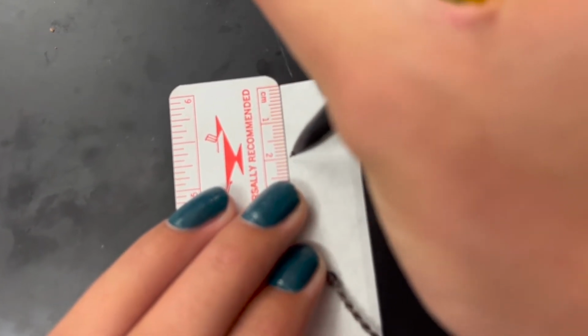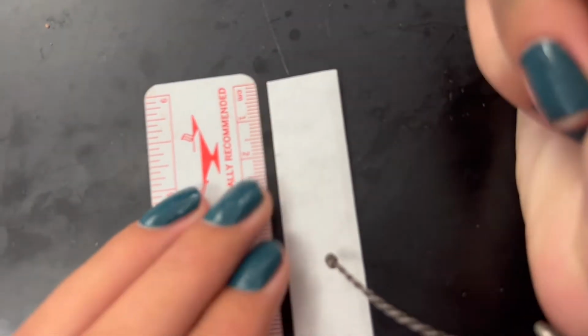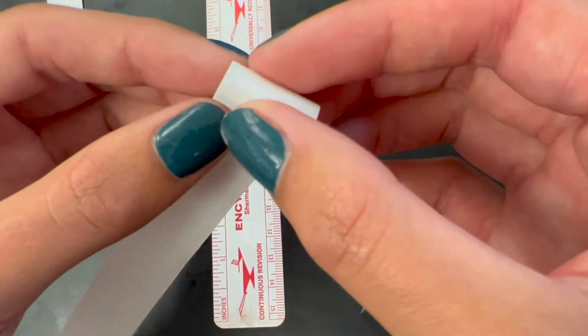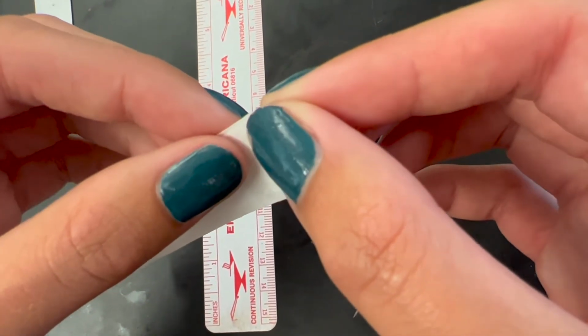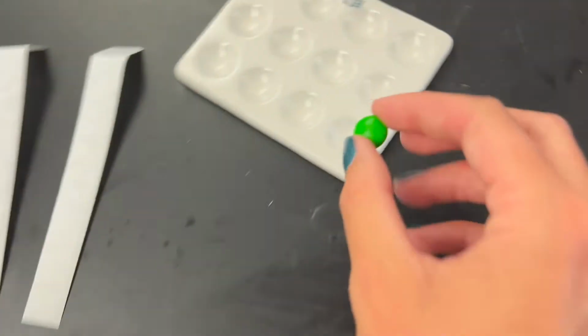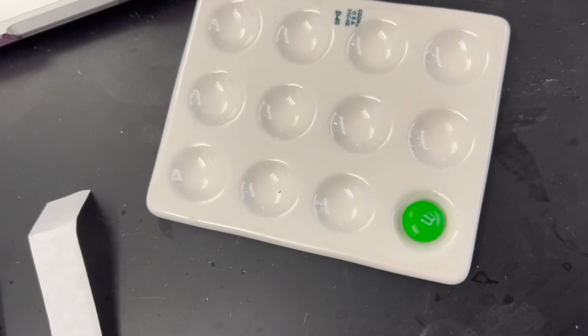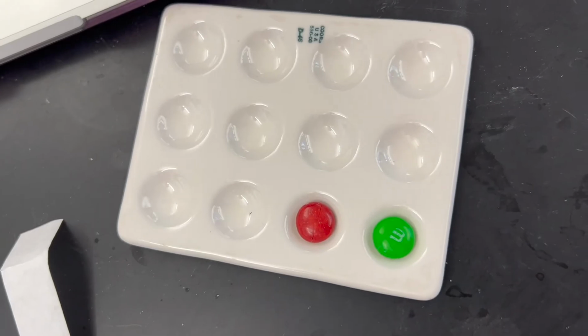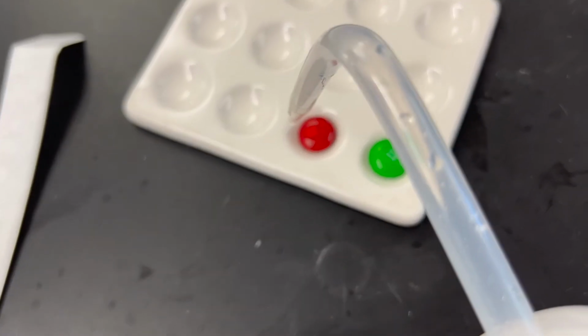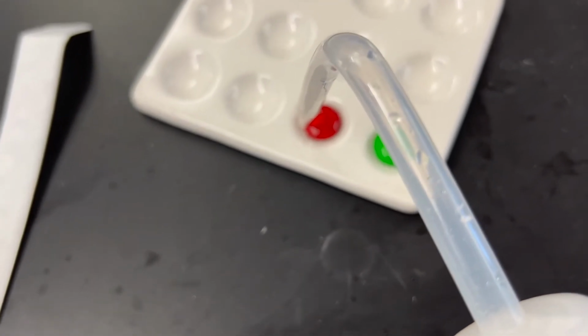Next, measure 20 millimeters from the top of the strip and fold across. This will create a lip that hangs over the edge of the flask once the paper is placed inside of it. Now take 2 different colored M&Ms and place them in separate wells on the well plate. Now add 1 to 2 drops of distilled water to each well. It's important to keep the dye as concentrated as possible, so avoid adding too much water.